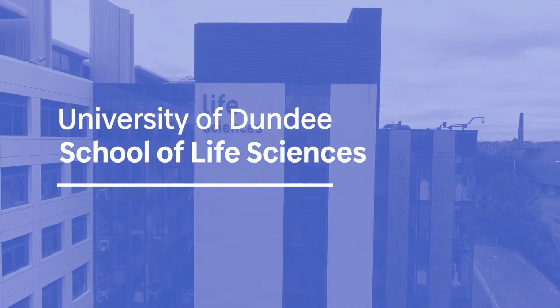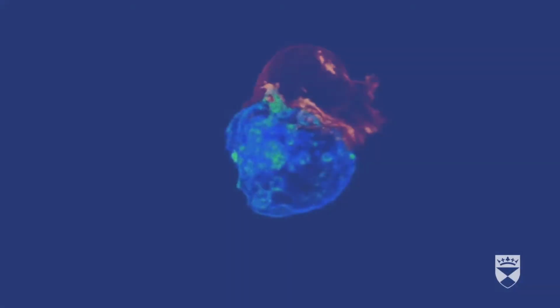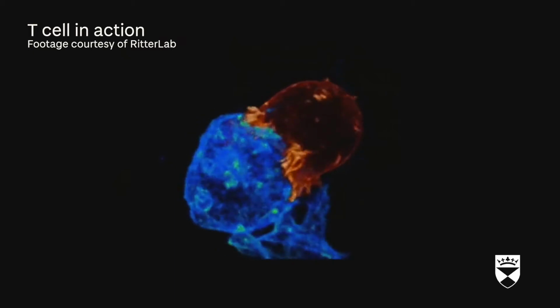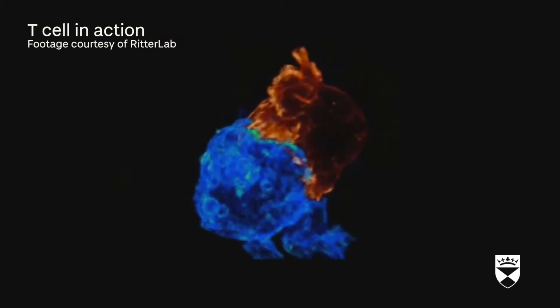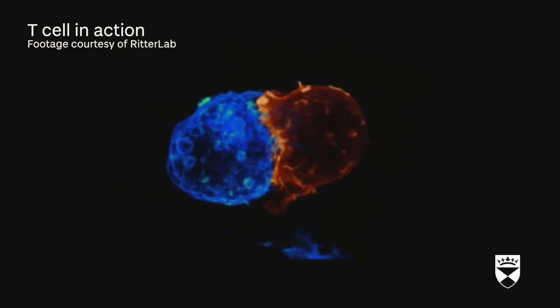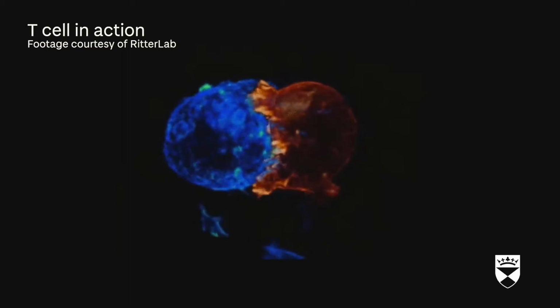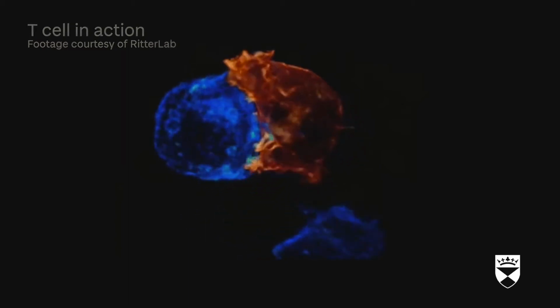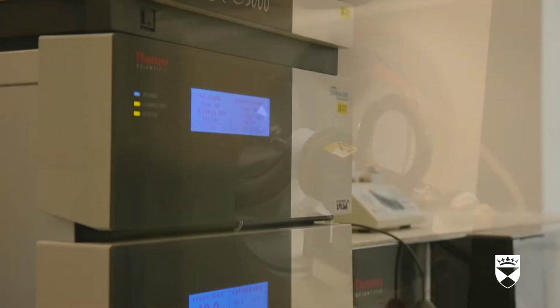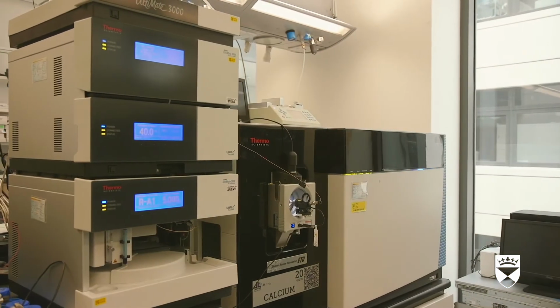If you have recovered from a cold recently, you should probably thank your T-cells. Your body has an amazing defense against infections called the immune system, which is made up of many types of immune cells. We study one type of immune cell called a T-cell. We are interested in how they grow and increase in number. We use a scientific instrument called a mass spectrometer, or mass spec, to study them.